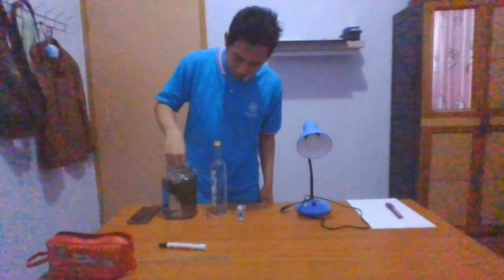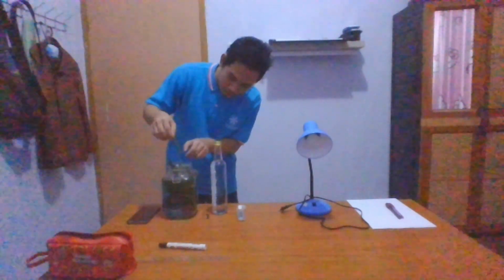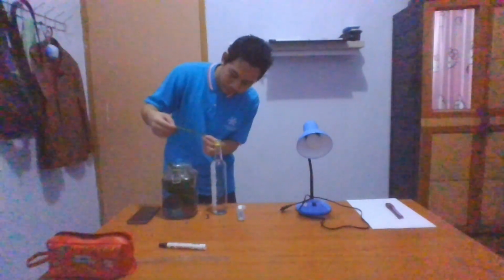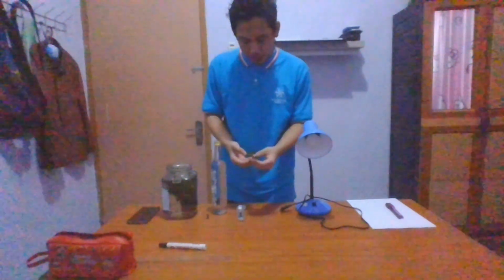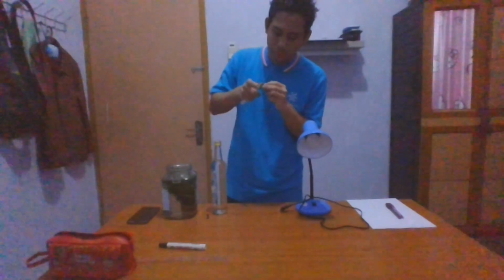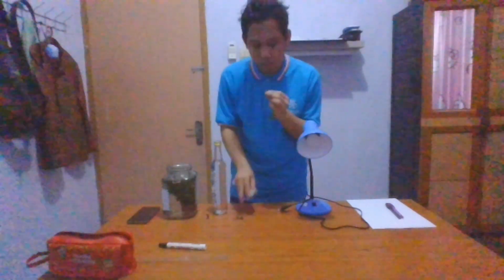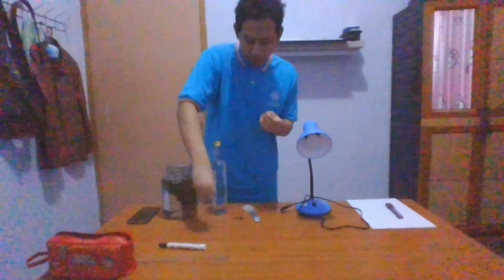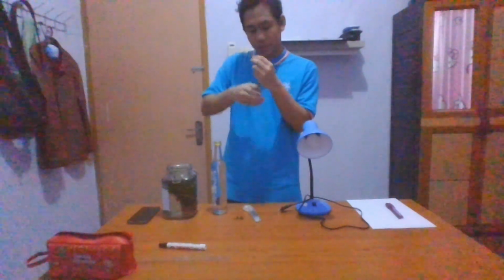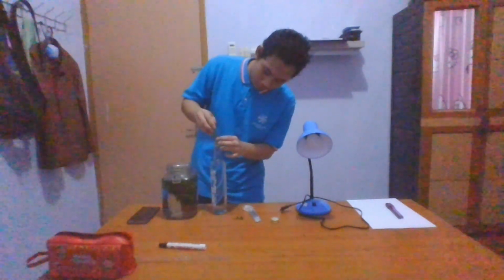Firstly, take out one Elodea plant, one stem. And then we need to cut it. So what I do after cutting the Elodea is using the paper clip to weigh down the Elodea inside the bottle.